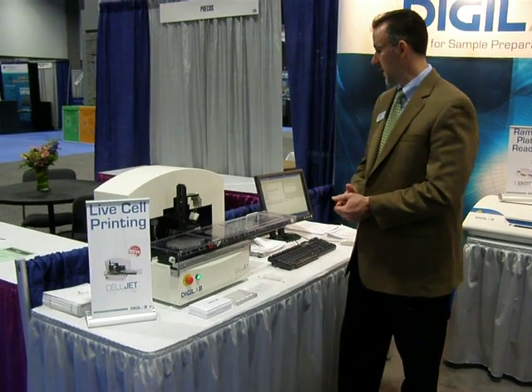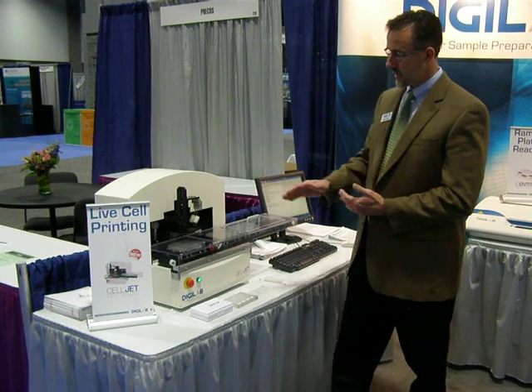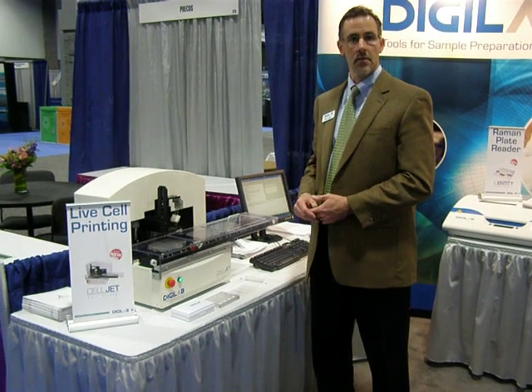The device is very easy to program, very flexible programming, PC-based. At the heart of the instrument is our SyncQuad technology, which allows us to dispense very rapidly but in a very safe manner — live cells and other fluid types.